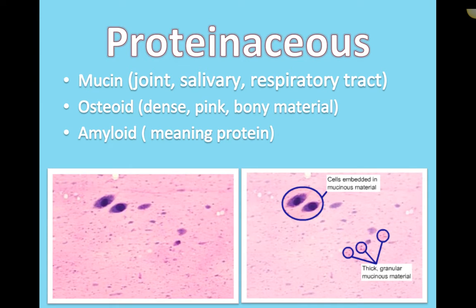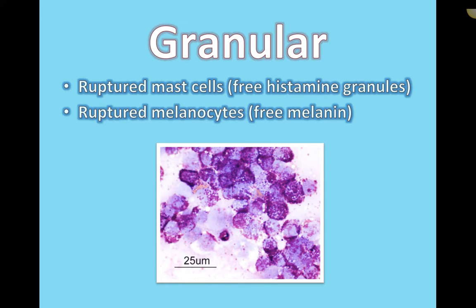I'm completely okay if you just describe it as proteinaceous or non-proteinaceous. That's completely okay. I don't expect you to go into great detail about it. Cytologists definitely will look at that proteinaceous background and identify the components within the proteinaceous background and then classify it accordingly. But for our purposes, just identifying it as having a proteinaceous background is helpful.